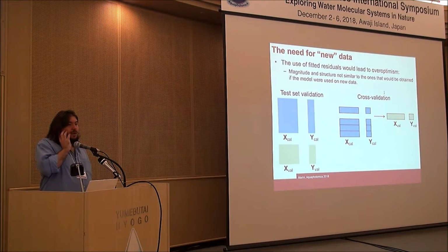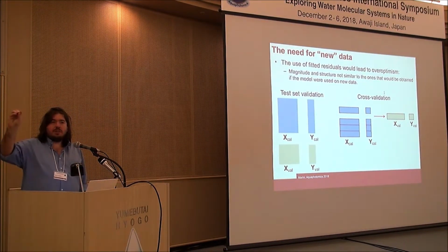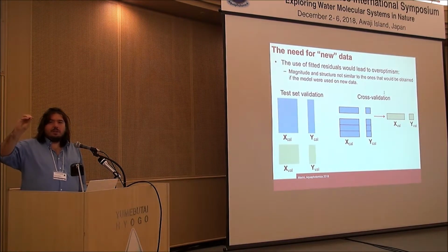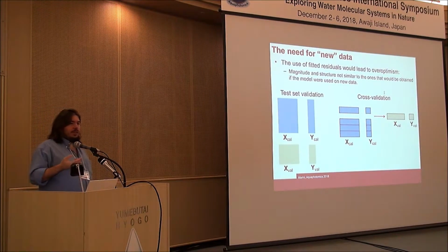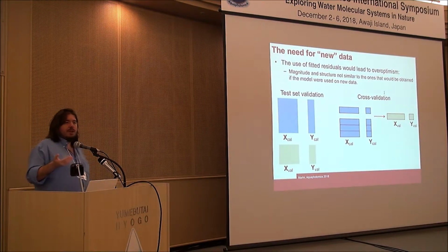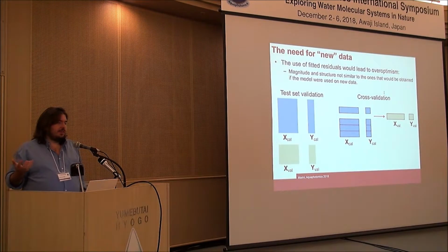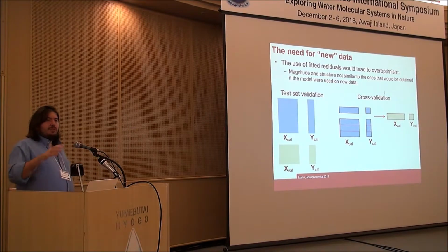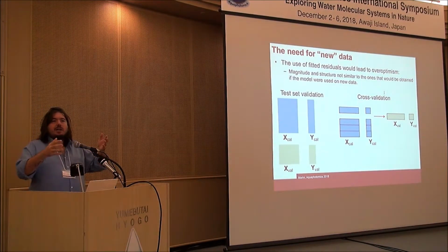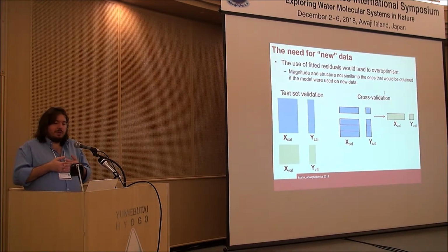However, when we speak about residuals, once we identify the diagnostics, we also need an additional step. Because of the least squares property of most of the methods that we use in common chemometric analysis, if we used only the residuals from modeling, so from the data we used to build our model from, then we will still not have reliable information.